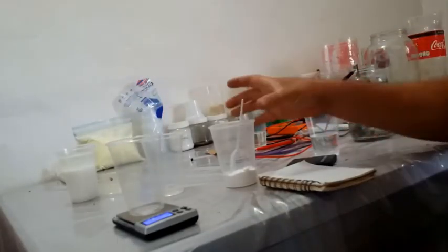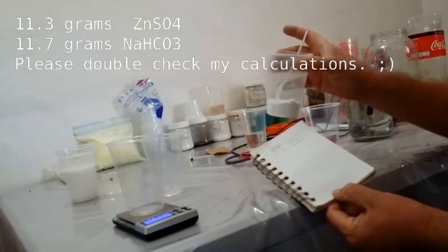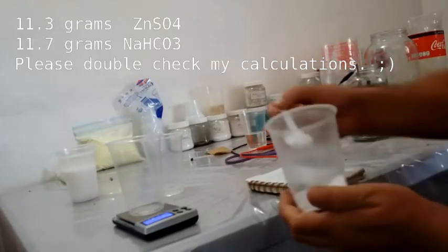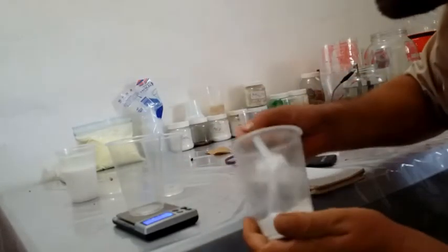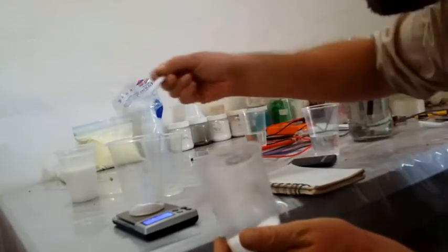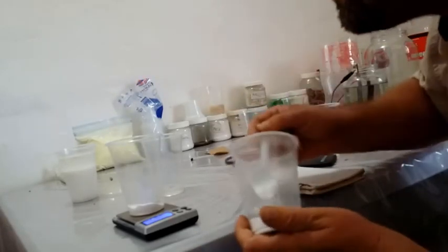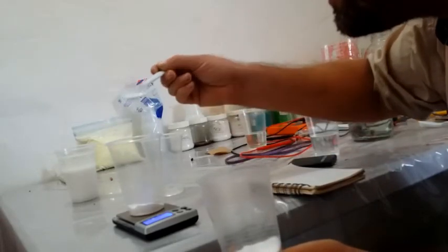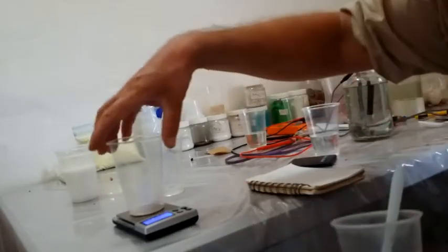So I'm going to weigh out — I've got it calculated out here — 11.76 grams. So I better measure that. Okay, 11.7 grams.